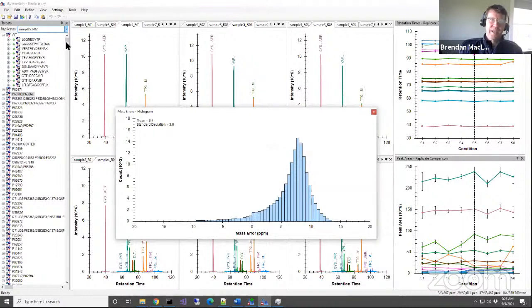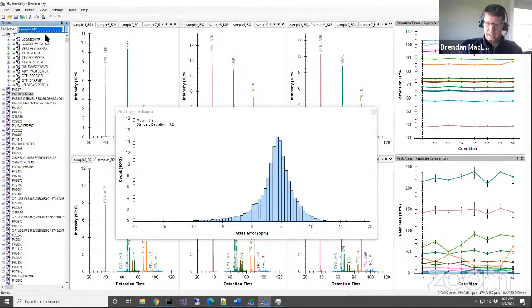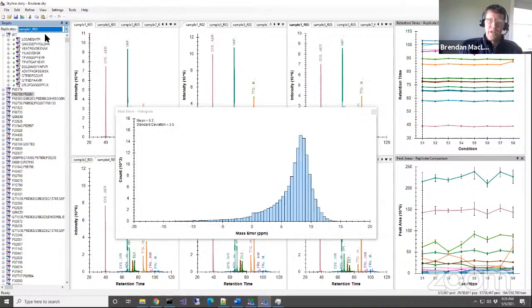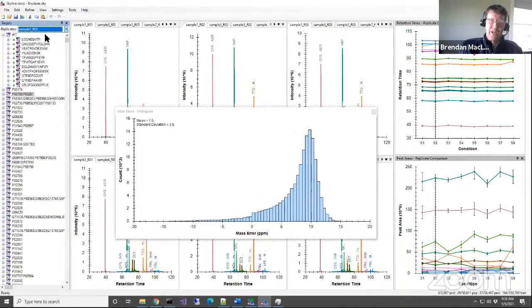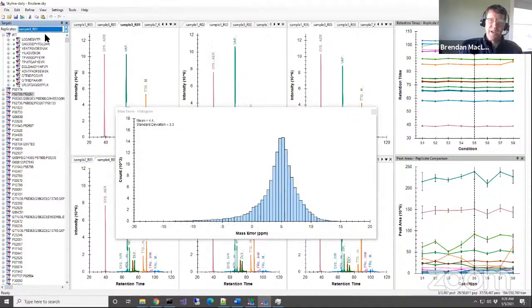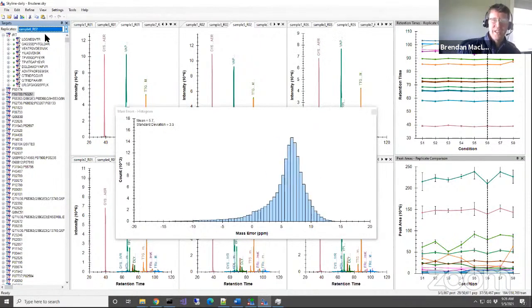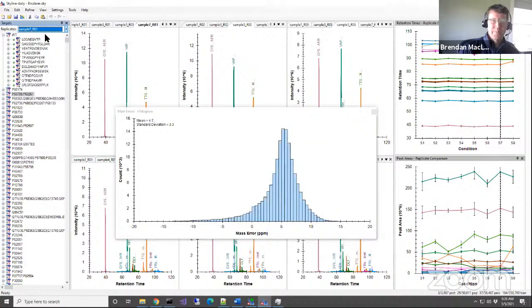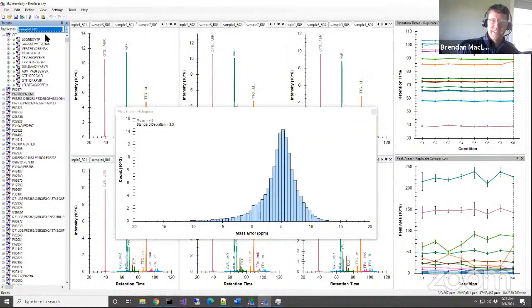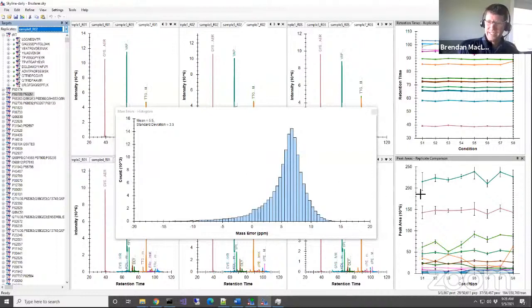But other than what I just showed you, sort of shifting through the replicates, we don't have a histogram way of looking at this over time. That would be kind of interesting to have: what was the mean over your experiments over time? So you can see it's shifting quite a bit actually. Remember that we're going through these things in acquired order.